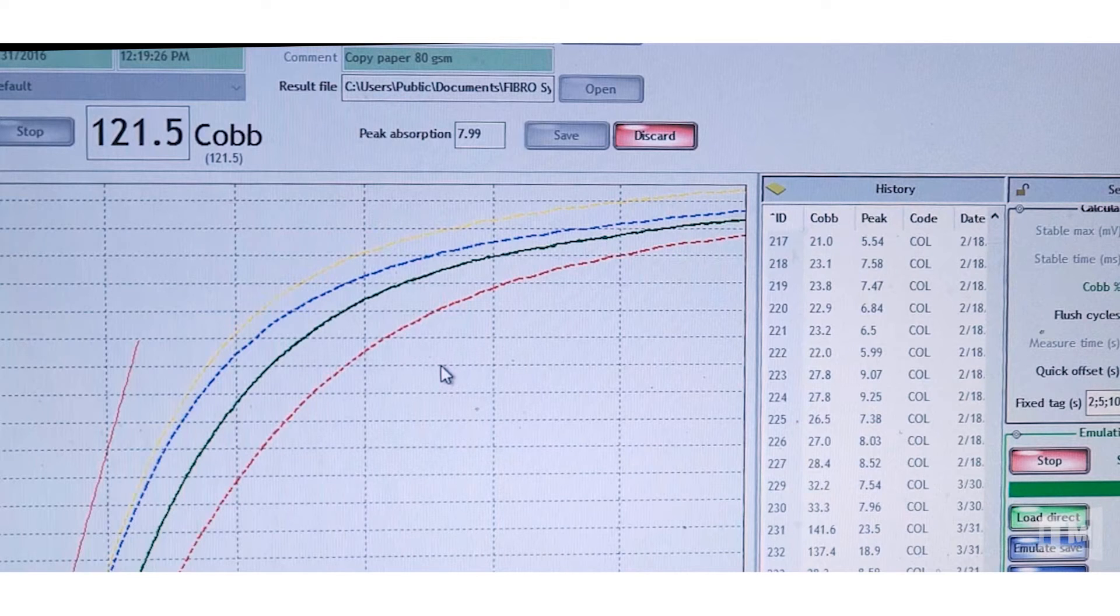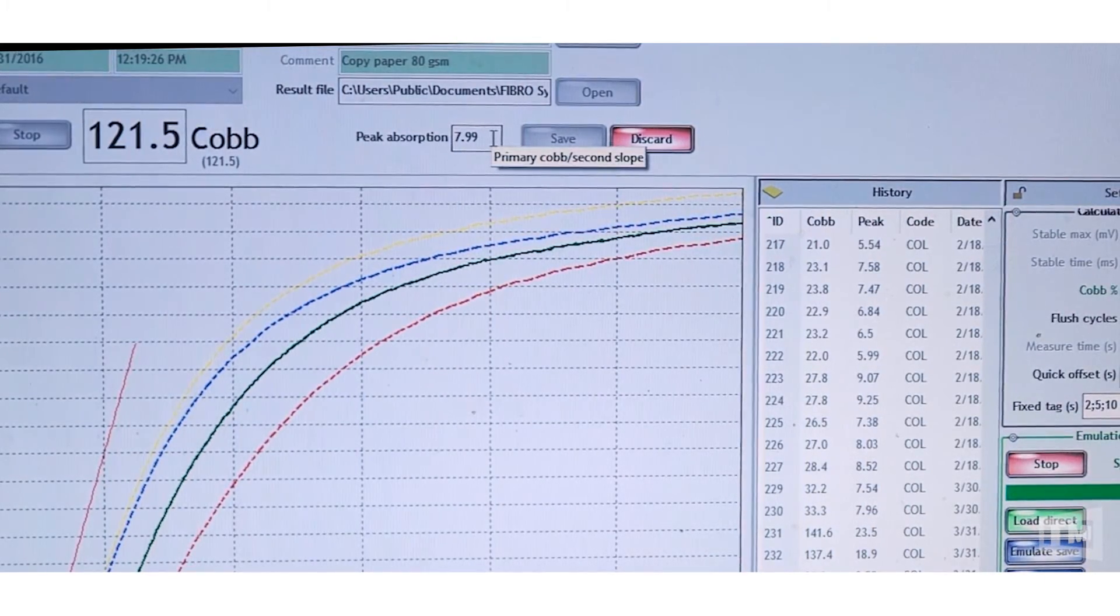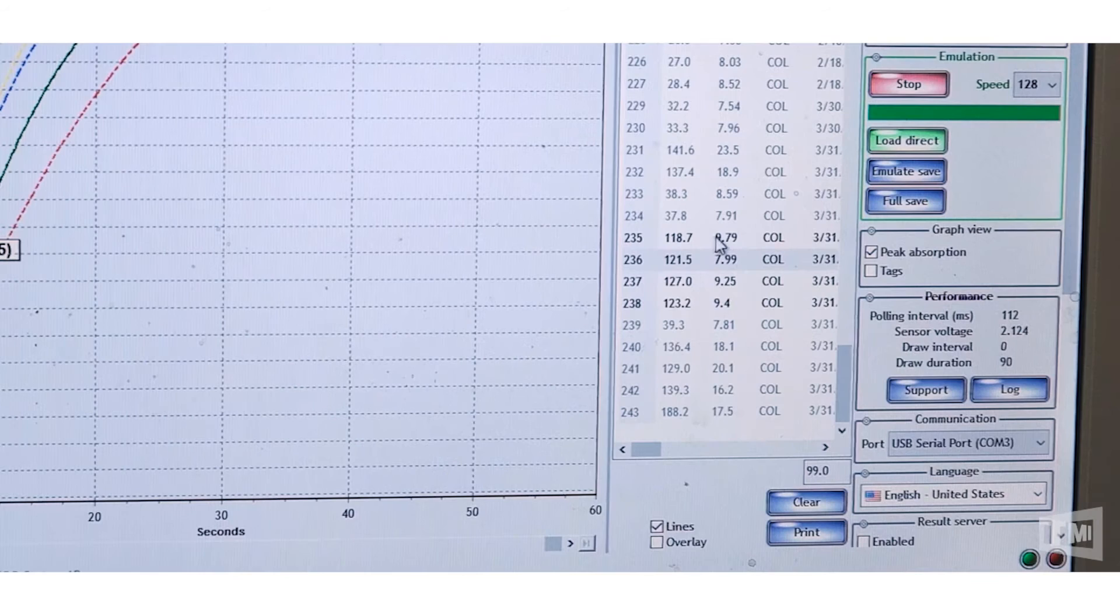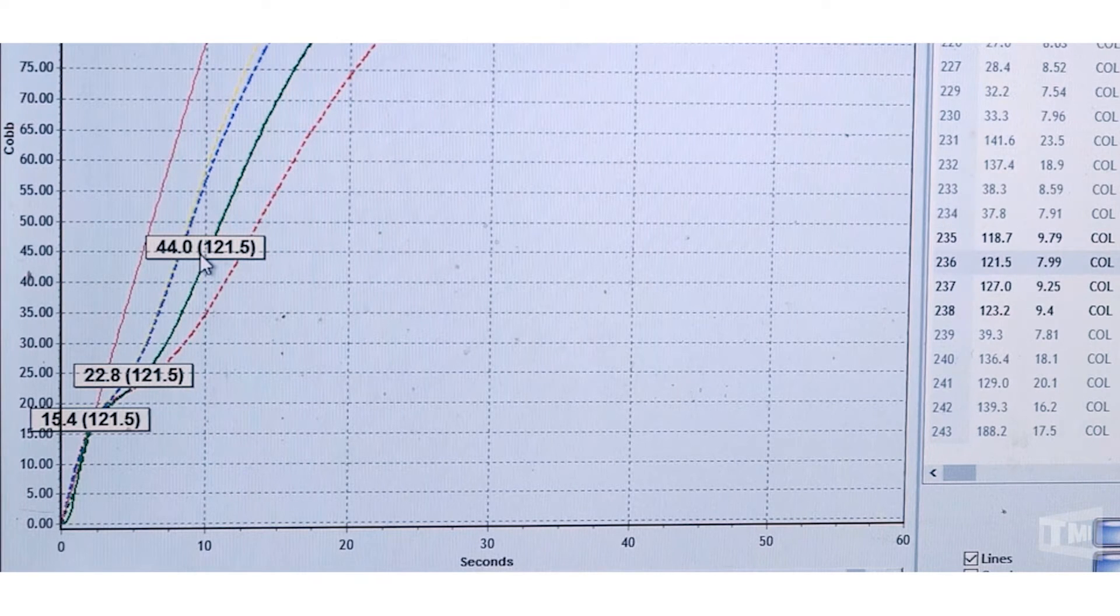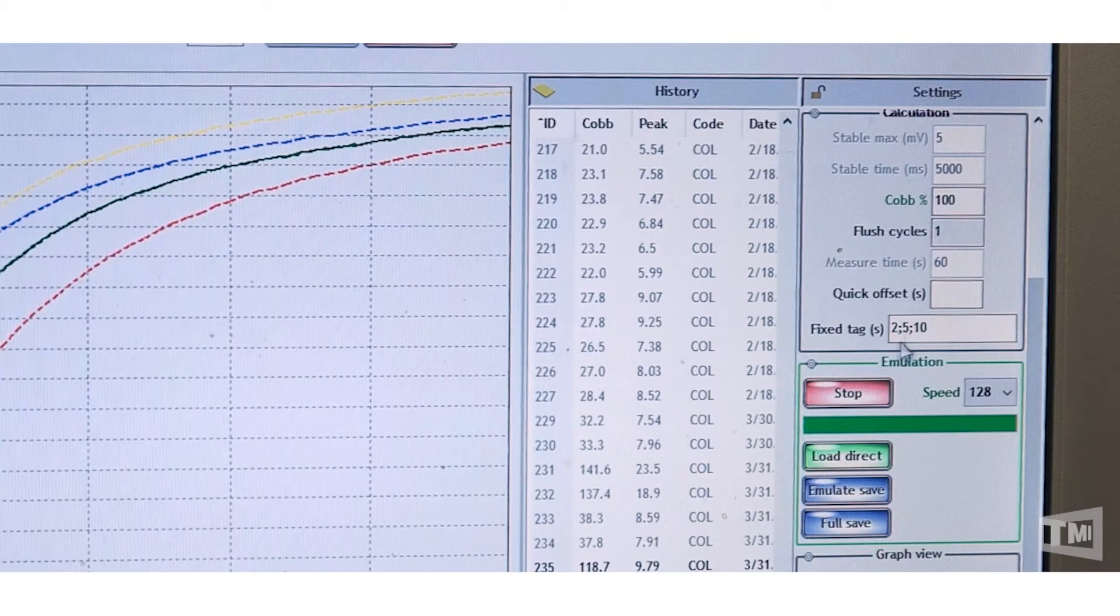In addition to what we're looking at here, as we did in the 30-minute Cobb, if you look at the peak absorption, they're pretty similar. There's only one that's basically off, and that's this one here, which is the one noted on the screen. And something that we can also do is, in your fixed tags, we can tag different times as the mill would like.